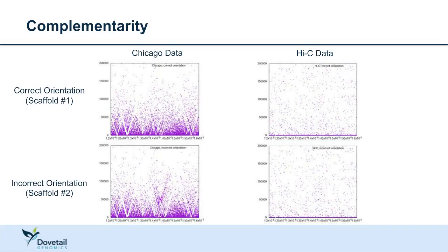So if a pair of reads map very close together, then it will appear more toward the bottom of the y-axis. If it's mapping further apart, you should see the dot more toward the top of the y-axis. The first thing you can see from this pattern is a higher density of purple dots at the bottom of the y-axis. That means that, as we see from decay, a lot of the data are mapping closer together, and as you increase the distance, you get fewer and fewer dots going up on the y-axis. So this is very expected.